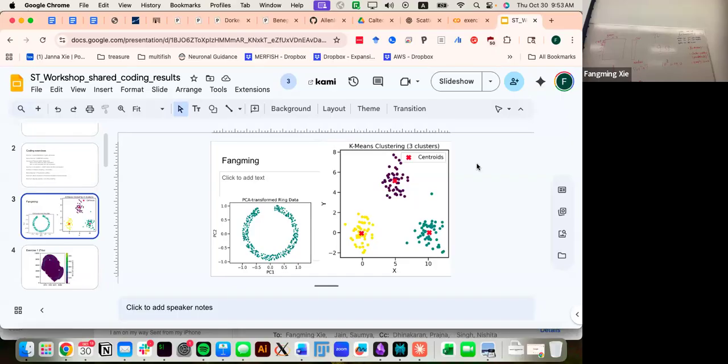It's applied on different subsets, with different normalization and different feature selection before clustering. So this takes one line, but there's over 800 of them. Once you know this, you can combine these different tools together. That's where it takes time.